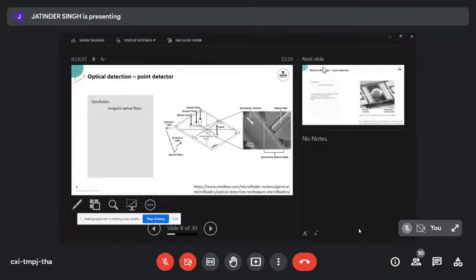So in addition to getting your liquids in your microchannels to carry the light, you can also actually buy optical fibers off the market and microfabricate slots in your microchip to get the fibers into your chip so that your light gets really nice and close to your channel. And that's what we can see here on the slide. We can see here a microchannel where we've got 3 different inlets, 1 for our sample, 2 for some sheath fluids.